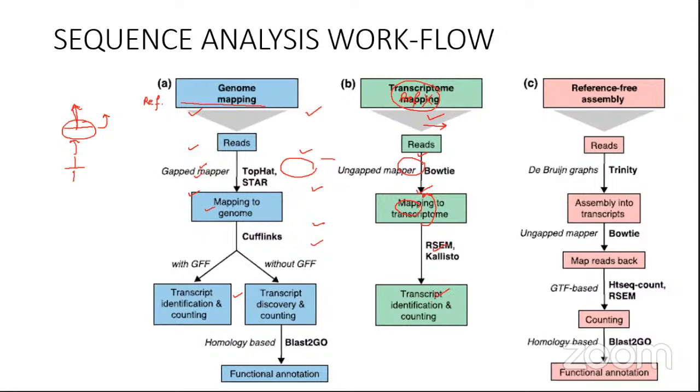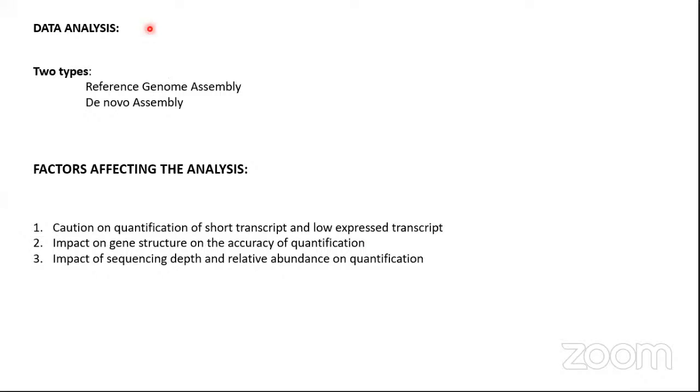So this is a general workflow. I am not going deep into how we use it and what exactly we have to do; that we will see in the subsequent steps. But this is the overall general workflow, which can be divided into these three kinds of analysis. So data analysis, as I mentioned, differs when we have the reference and when we do not have the reference.